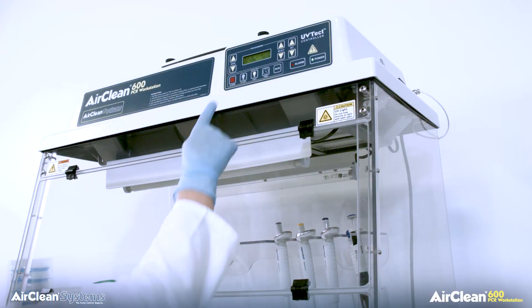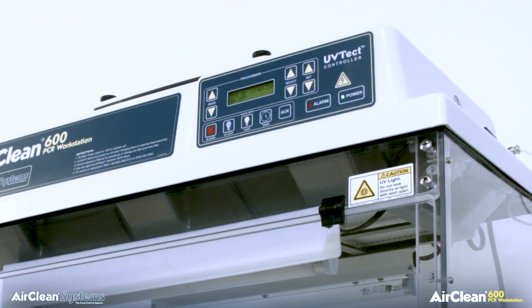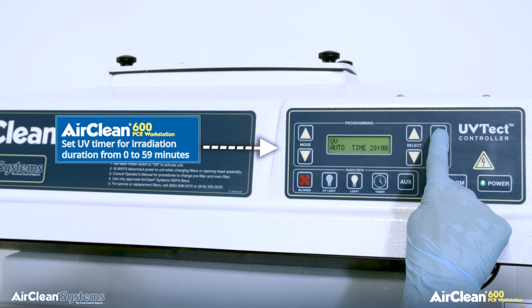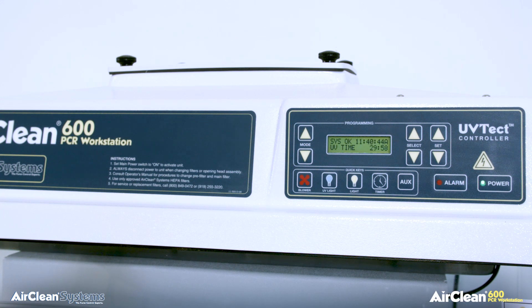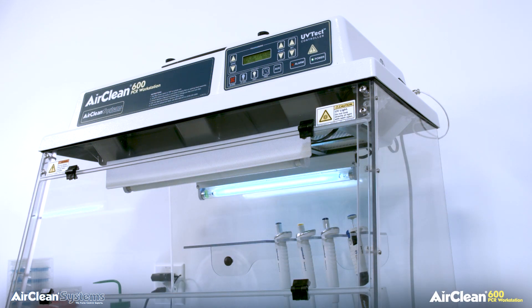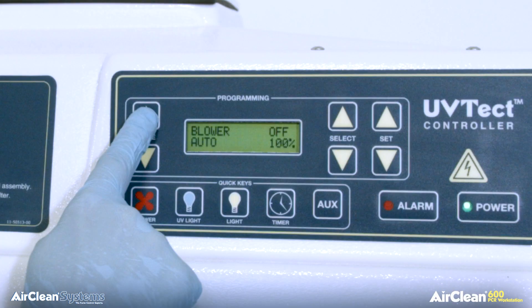To activate the UV bulb, simply press the UV light button on the membrane keypad of the UV-TECT microprocessor controller. A digital UV timer is incorporated into the UV-TECT controller, which allows the user to set the irradiation time up to 59 minutes. One of the most important features the UV-TECT controller provides is UV bulb monitoring. Each UV bulb has a definable usable life, and UV-TECT monitors and alerts the operator when the useful life of the bulb has been reached. The UV-TECT controller also allows the operator to manually adjust the airflow, accommodating even the most fragile samples.